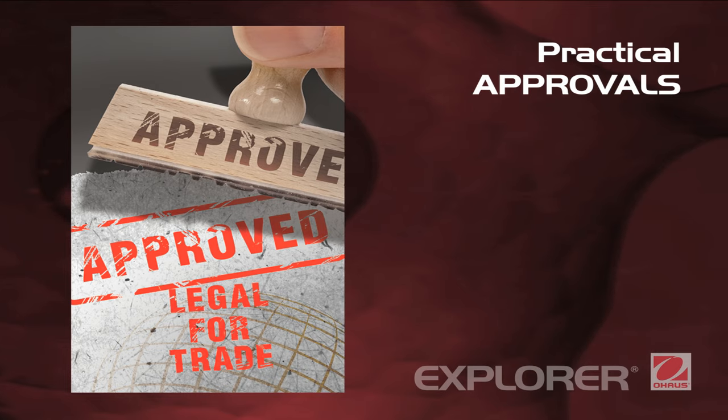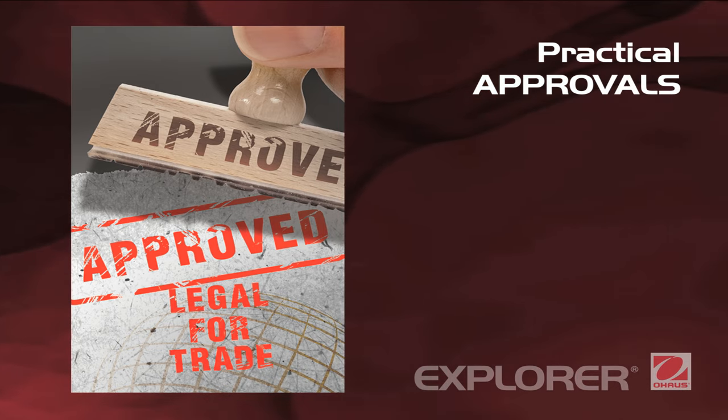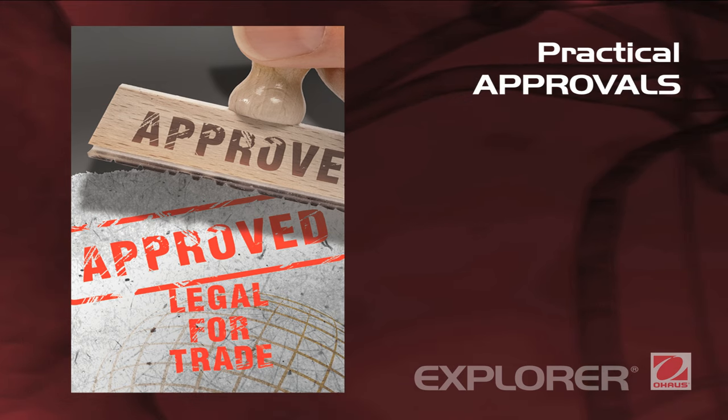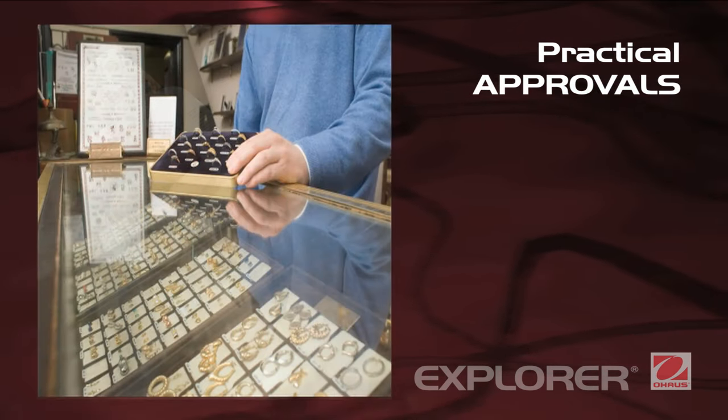Practical approvals. Explorer is designed and engineered to meet stringent international metrological requirements for use in legal applications, such as pharmacies, jewelry stores, and retail outlets.